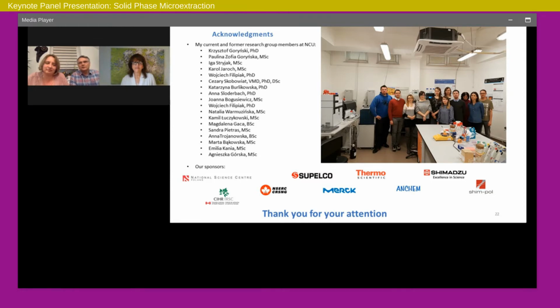And therefore, remote communities, for example, northern Canada, Africa, the issues of providing services to those communities could be very easily reached by those technologies. So this is definitely one of the futures. In addition, of course, the whole lecture is the future because not many labs are using it.